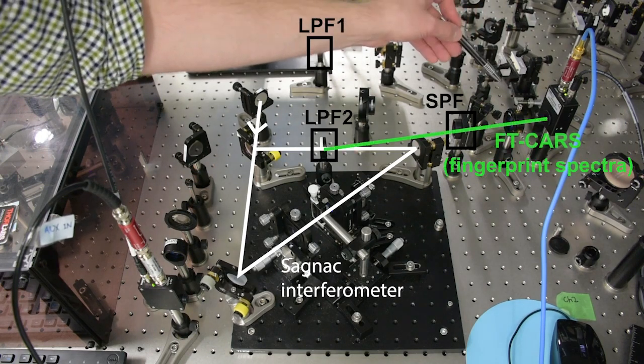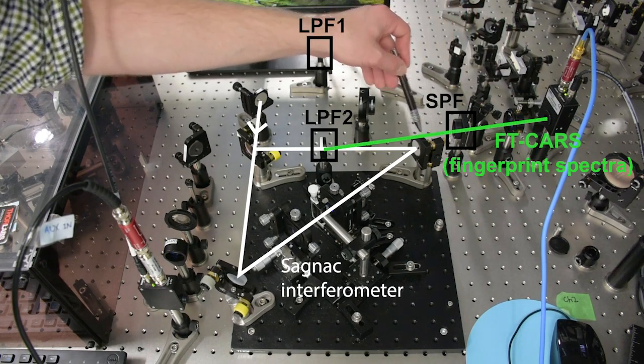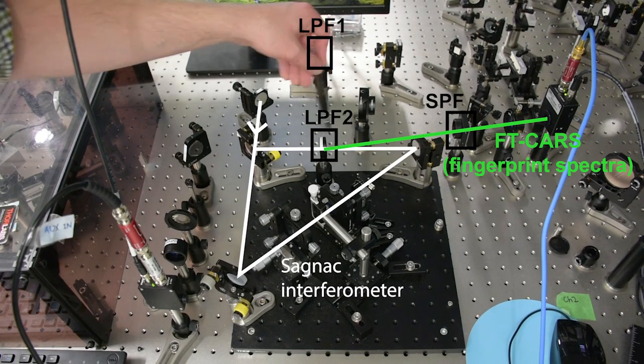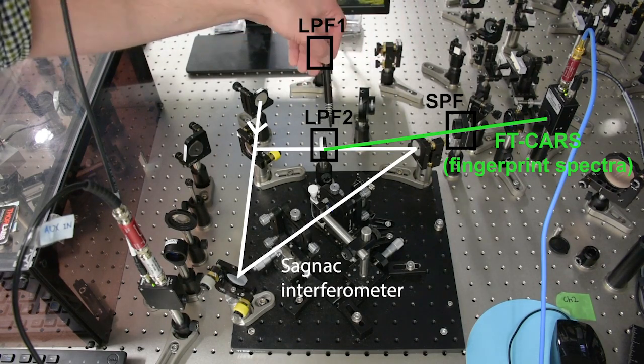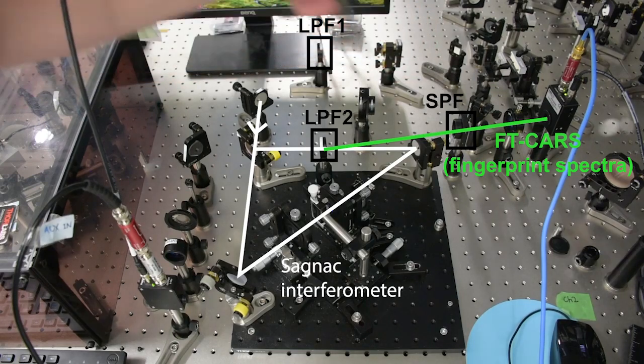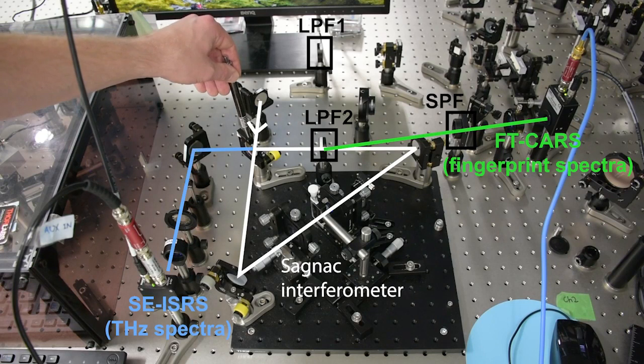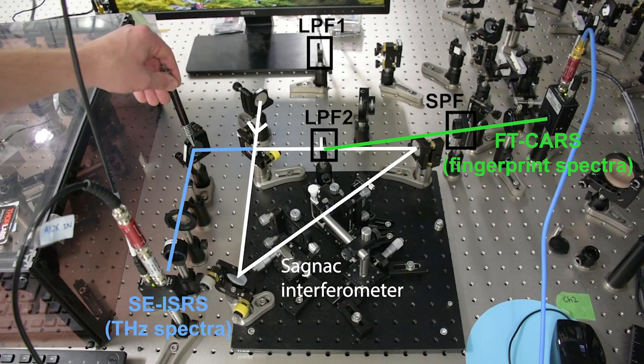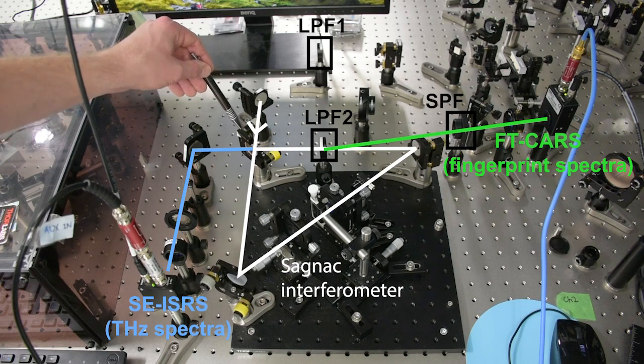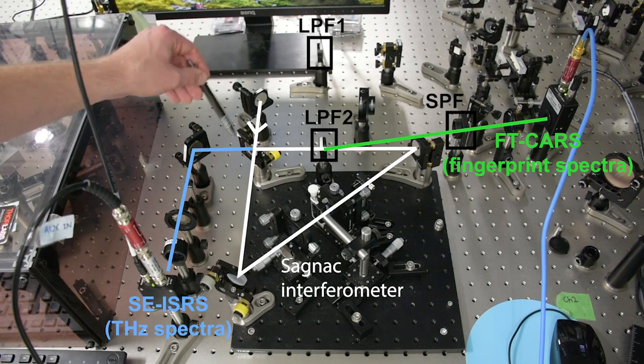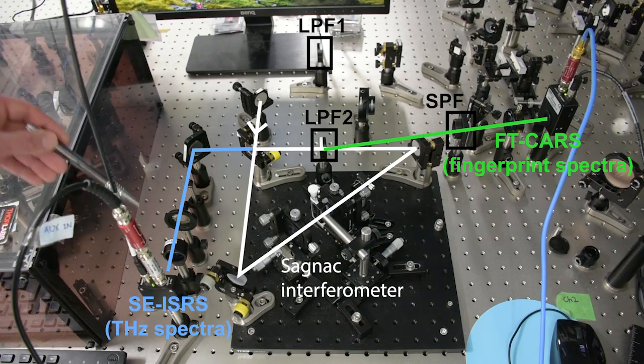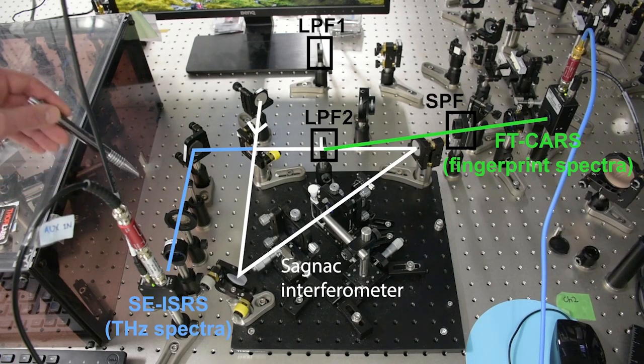Here's the APD which detects FT-CARS. At this long-pass filter in the Sagnac interferometer, the reflected signal is the frequency-shifted probe signal and passes through this short-pass filter. At the Sagnac interferometer exit in this direction, we have the interference of the local oscillator and the phase-delay-shifted probe. That interference is detected at this photodetector as SEISRS.